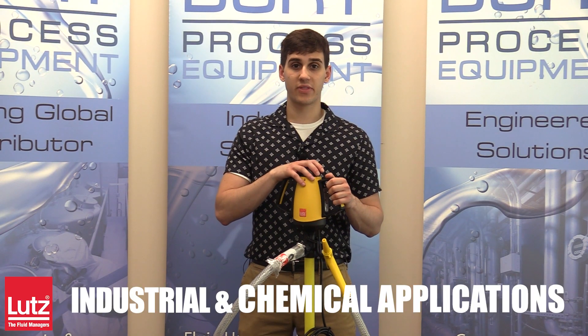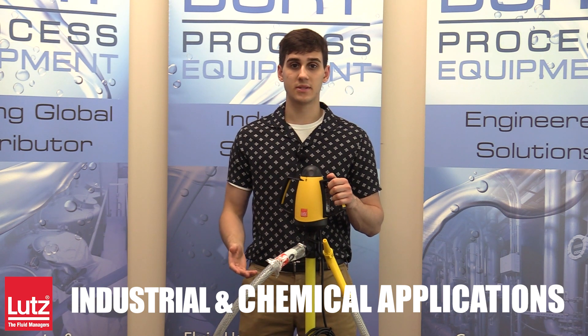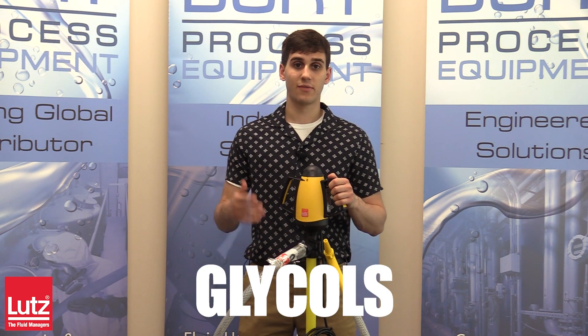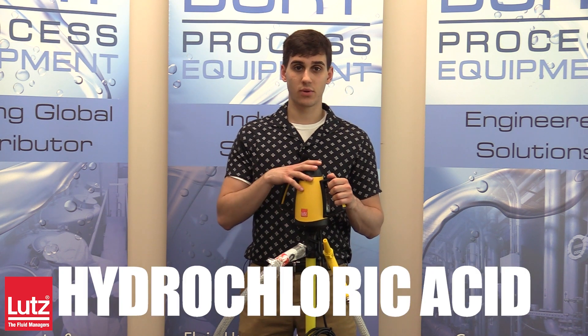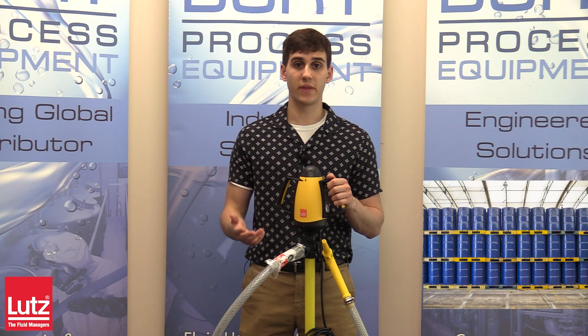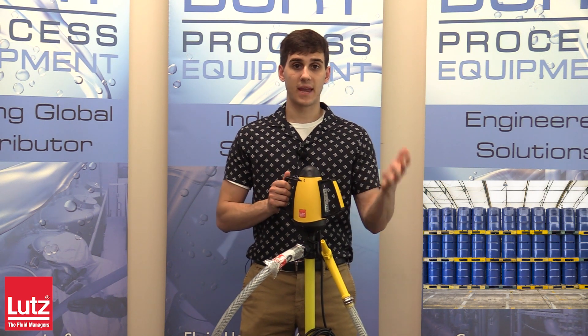This pump is designed for transfer of thin, non-flammable fluids such as battery acid, ammonia, glycols, phosphoric acid, hydrochloric acid, and hydrogen peroxide, and is best suited for filling small quantities from canisters and drums.